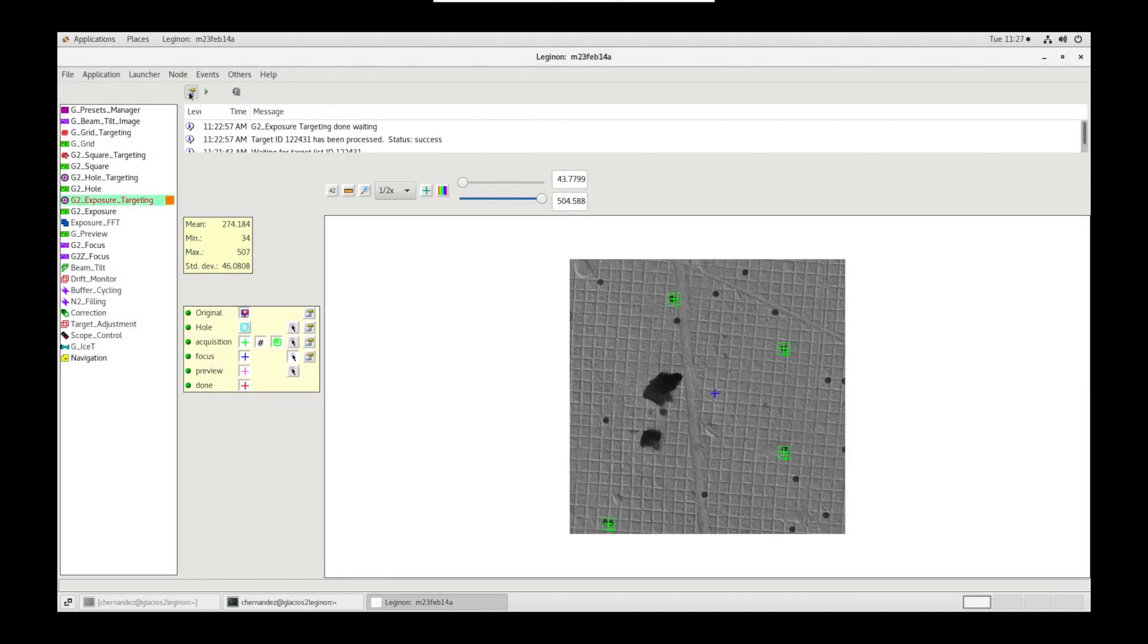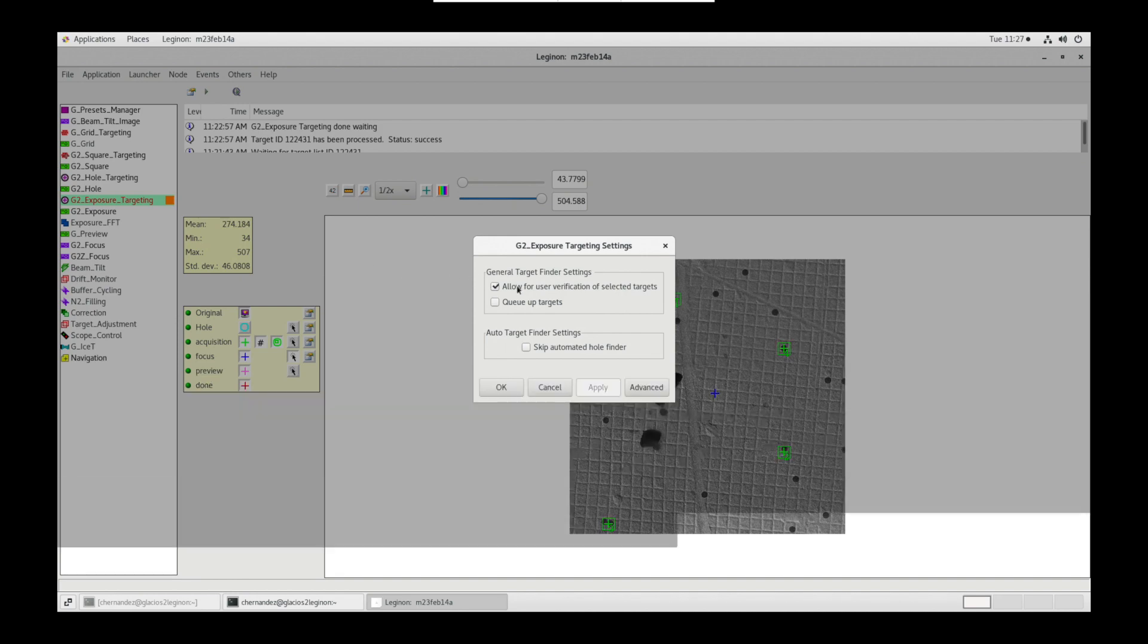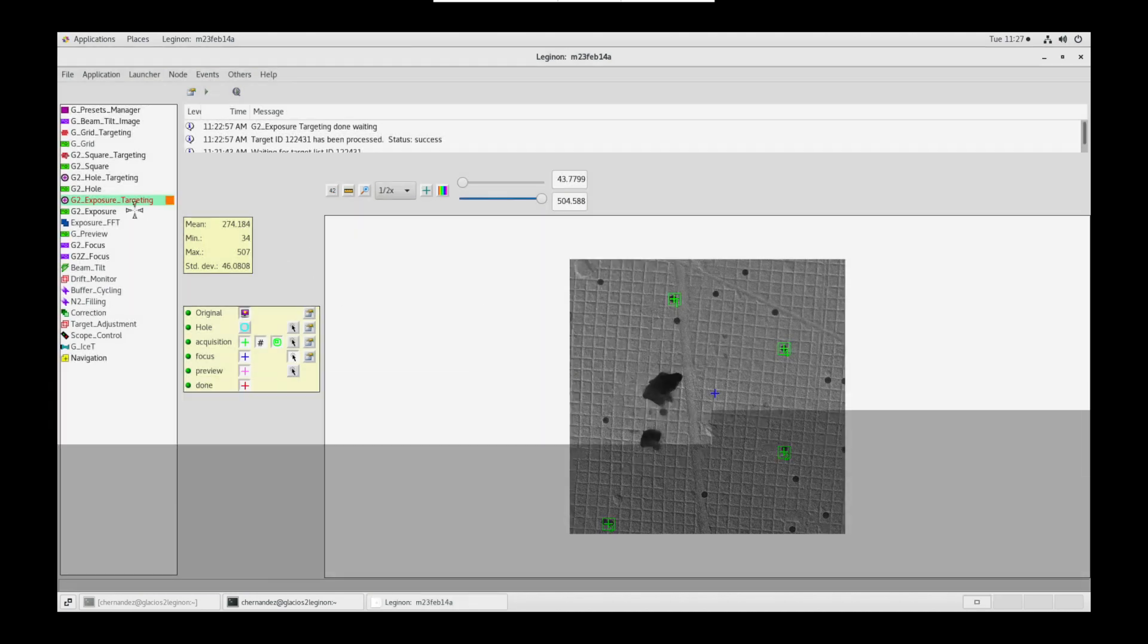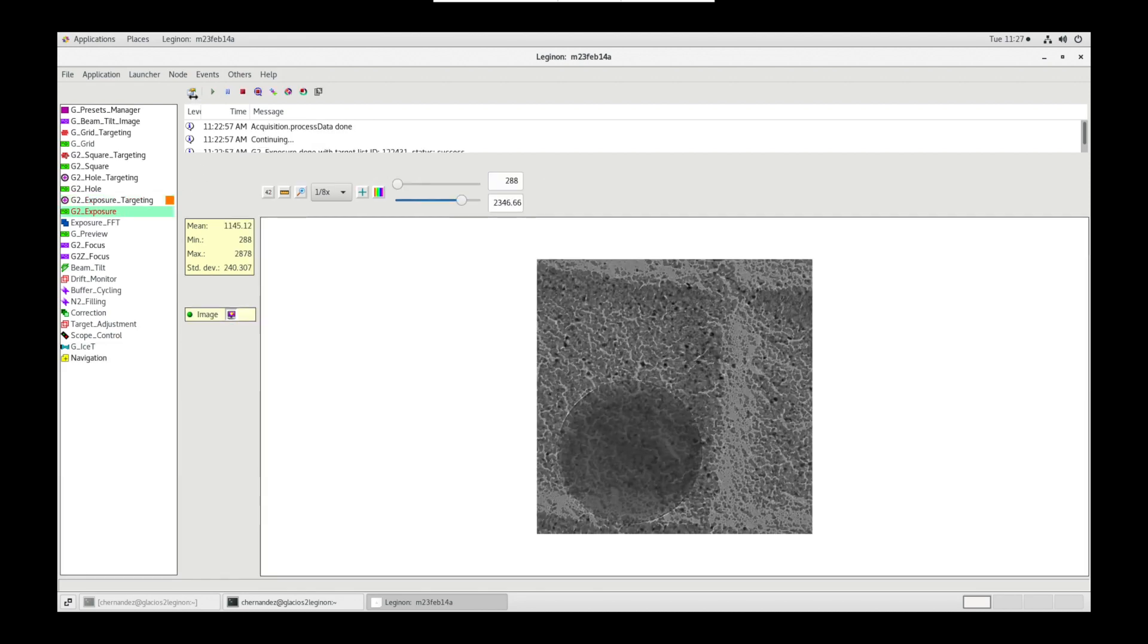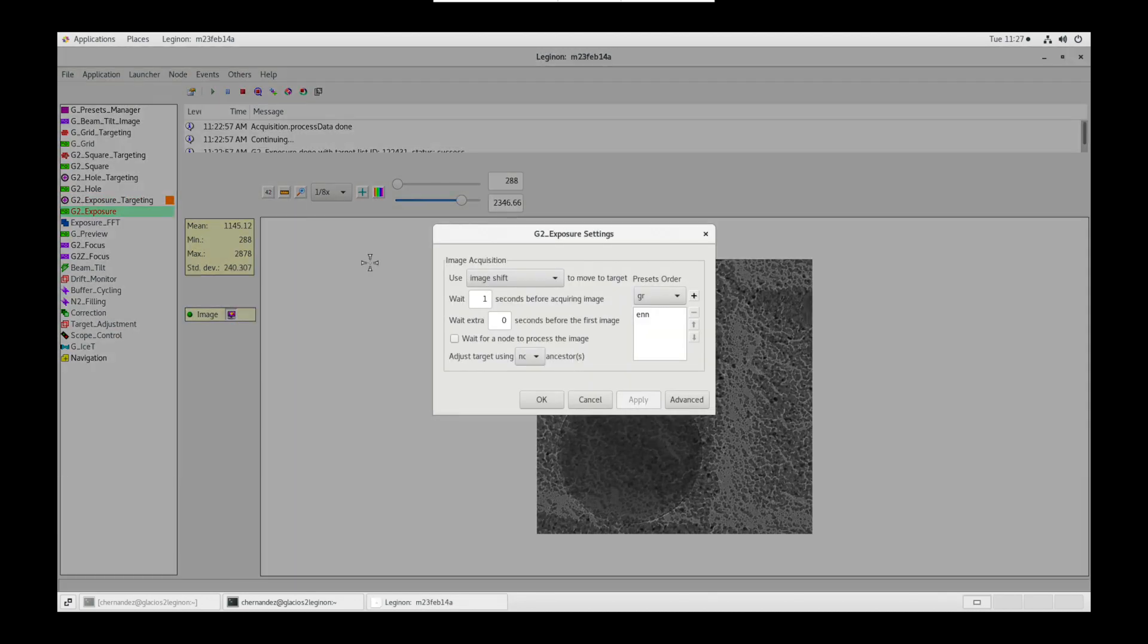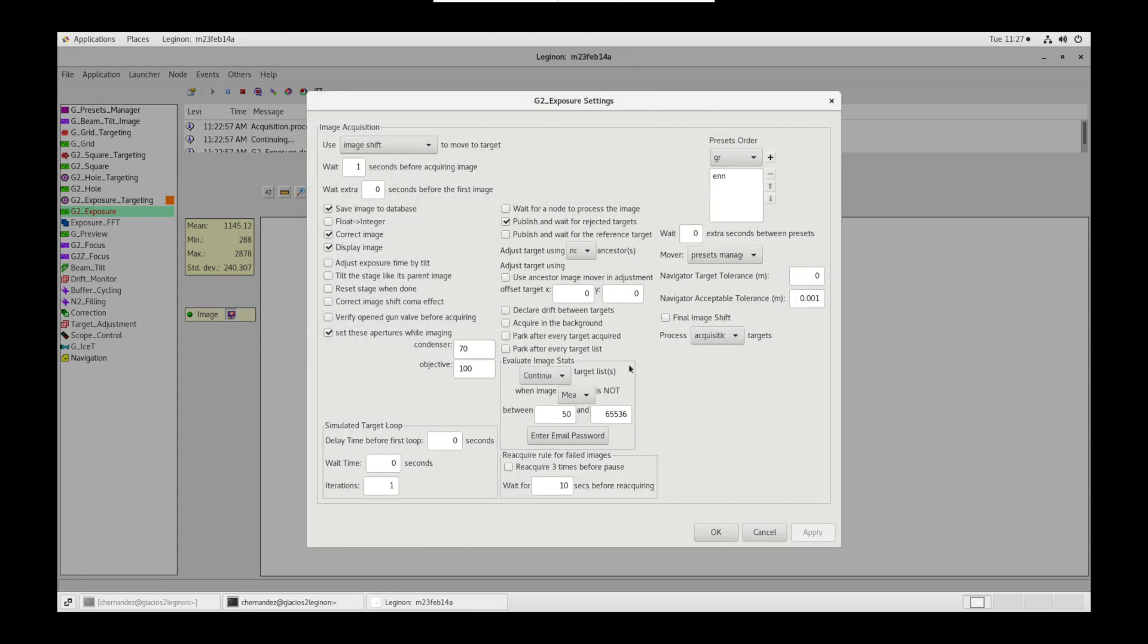In exposure targeting node settings, allow user verification of selected targets is checked and the other two are unchecked. In exposure node settings, wait for a node to process the image is unchecked. Preset is ENN. And in advanced, set these apertures while imaging is checked with these values.